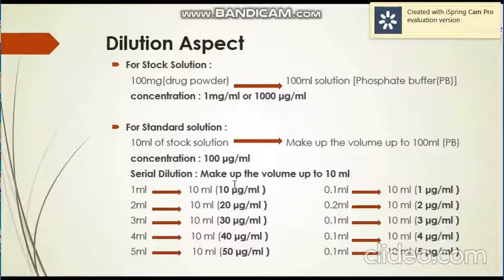It's all about the game of proper dilutions. Any concentration or any strength you can take, and with a suitable dilution you can vary that dilution changes.